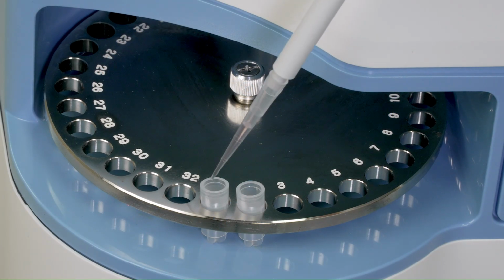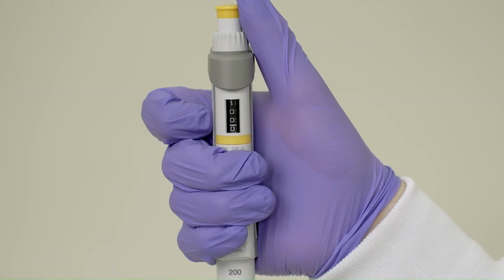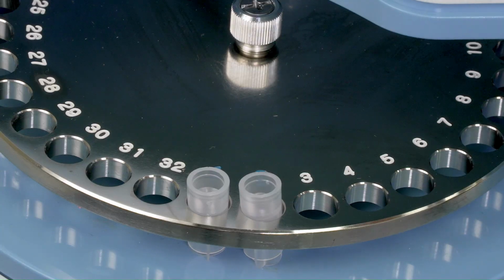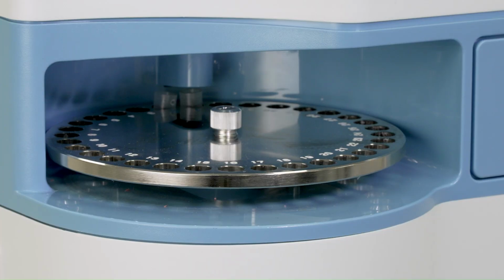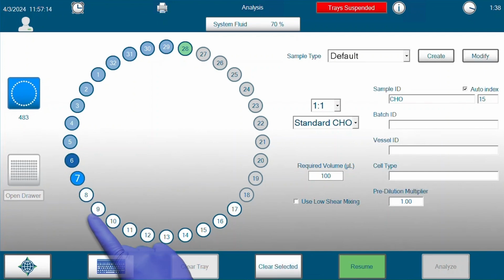It is important to always pipette exactly 100 microliters into the cup when running an analysis. Samples must be run using NOVA's FAST CDV sample cups. The carousel has 32 cup locations, of which 12 are available at any given time for loading cups. You can load all 12 locations and begin your analysis, and then continue to load as new sample cup locations become available again.